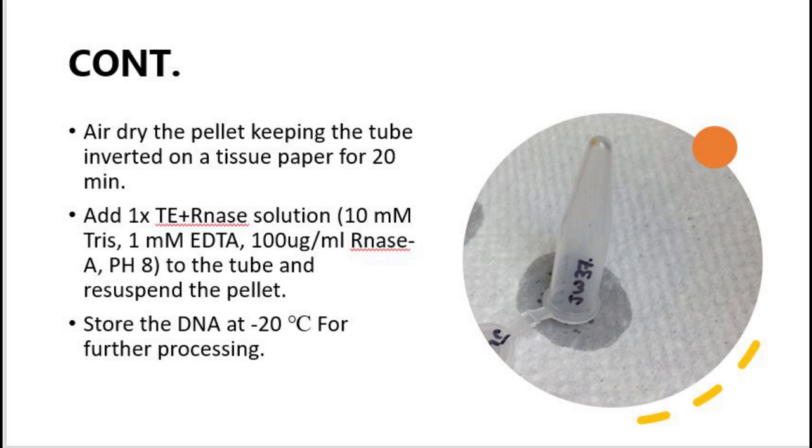When the pellet is dry, then add resuspension buffer to the pellet to resuspend it. Resuspension buffer is a 1xTE buffer containing RNase. RNase is an enzyme that will digest the RNA present in the pellet and you will have pure DNA.